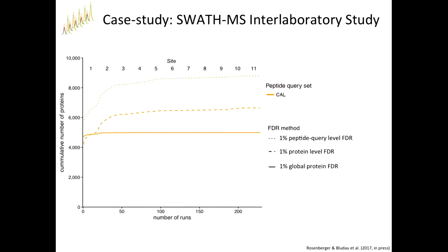May I again ask what the minimum library size would be, which would be useful, because we still need to approximate the decoys distribution, and in such experiments where we have only several proteins, for example in AP samples or something. Good question. I don't know if I can give you a good number for the minimum size.